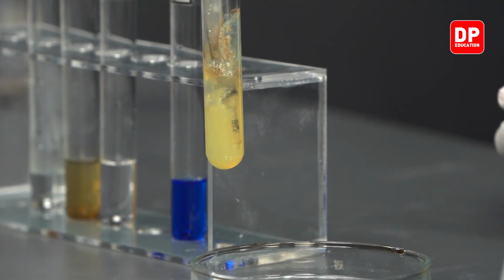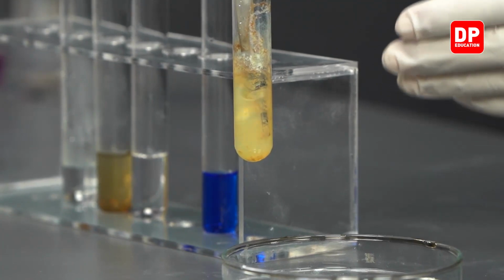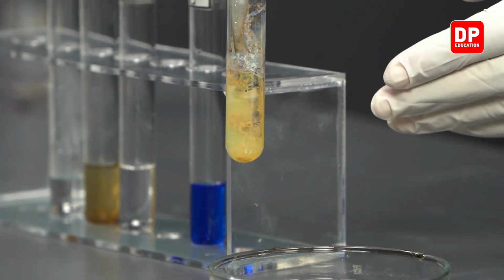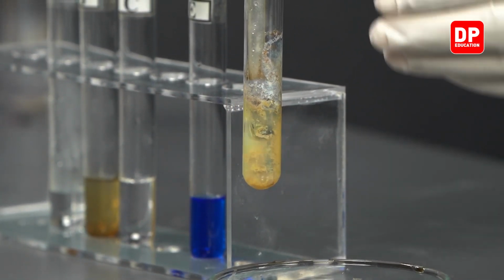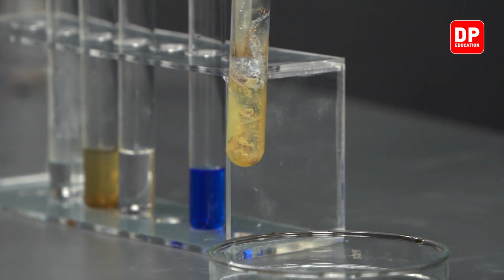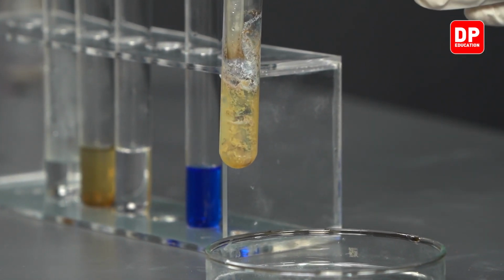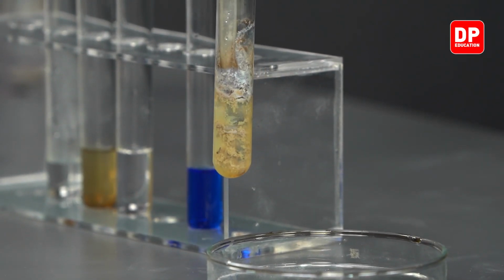And you can see immediately as acetylene gas comes into contact with ammoniacal silver nitrate, a precipitate is starting to form. So this precipitate is formed because acetylene reacts with ammoniacal silver nitrate to form silver acetylide, which is a water insoluble precipitate.